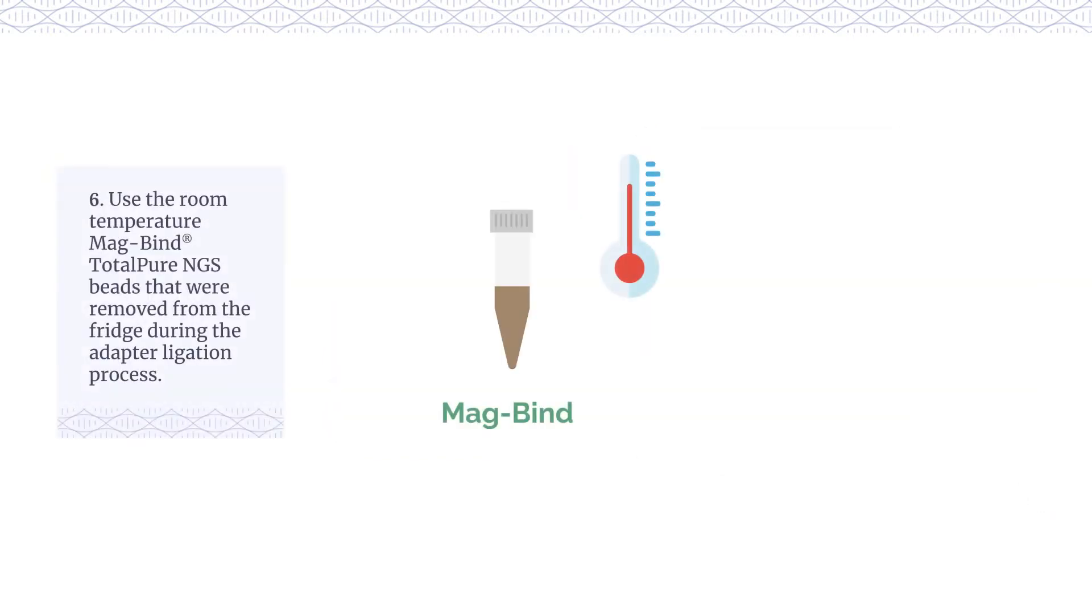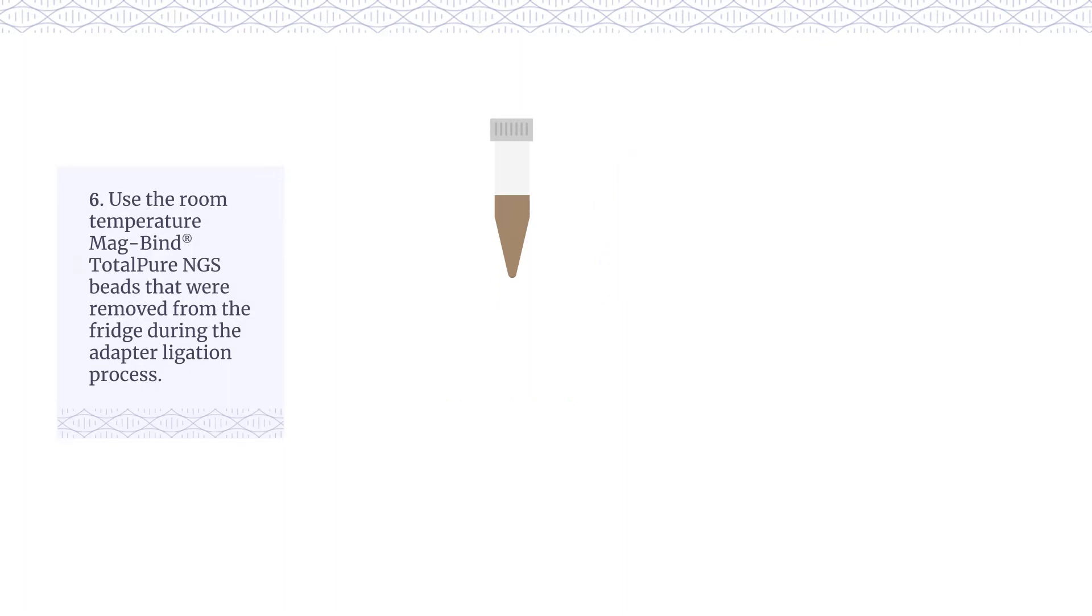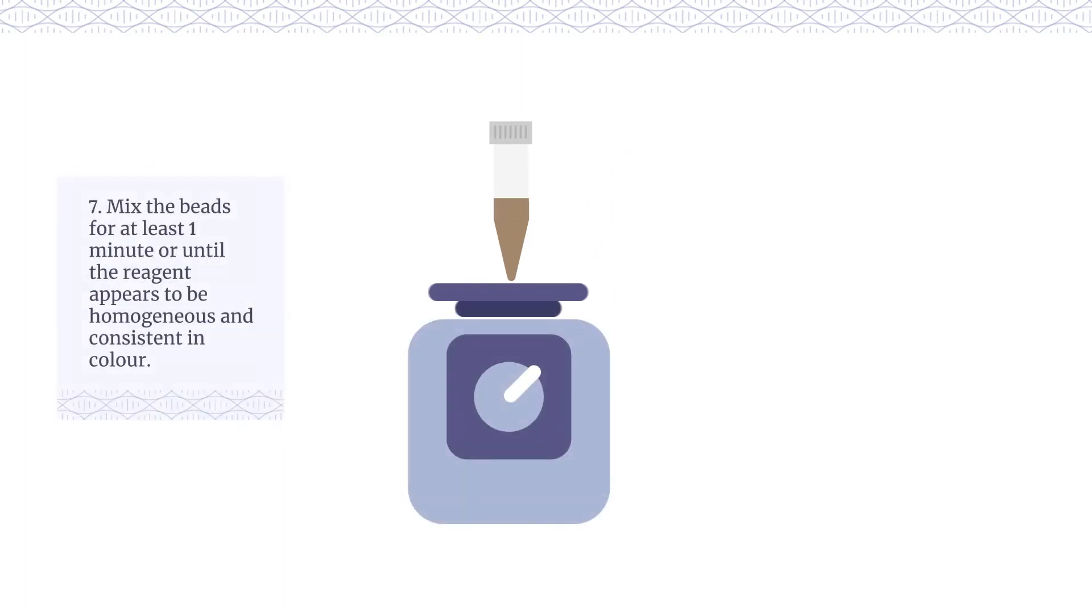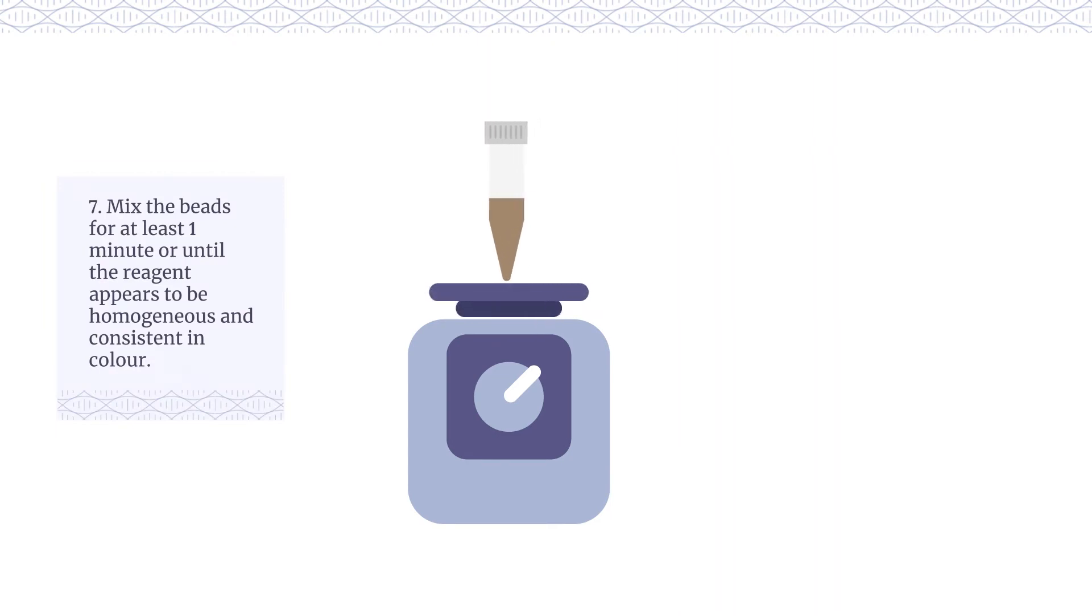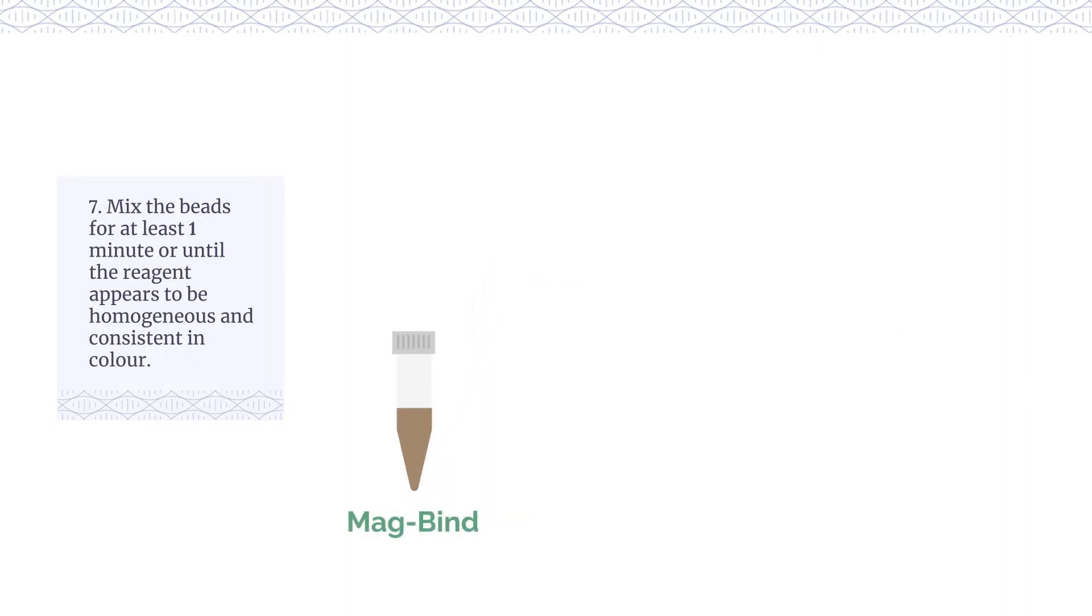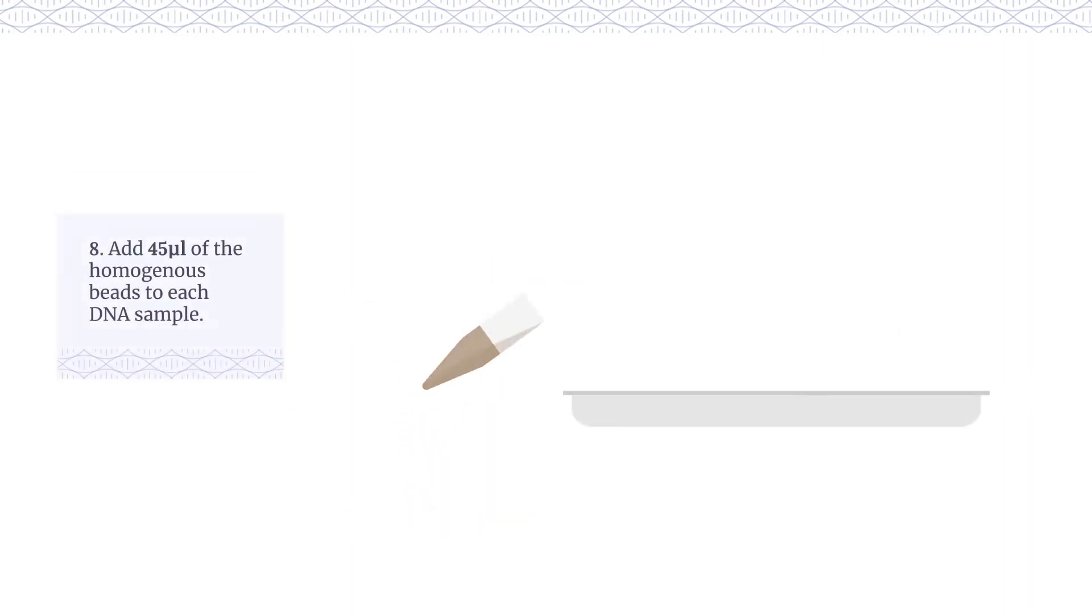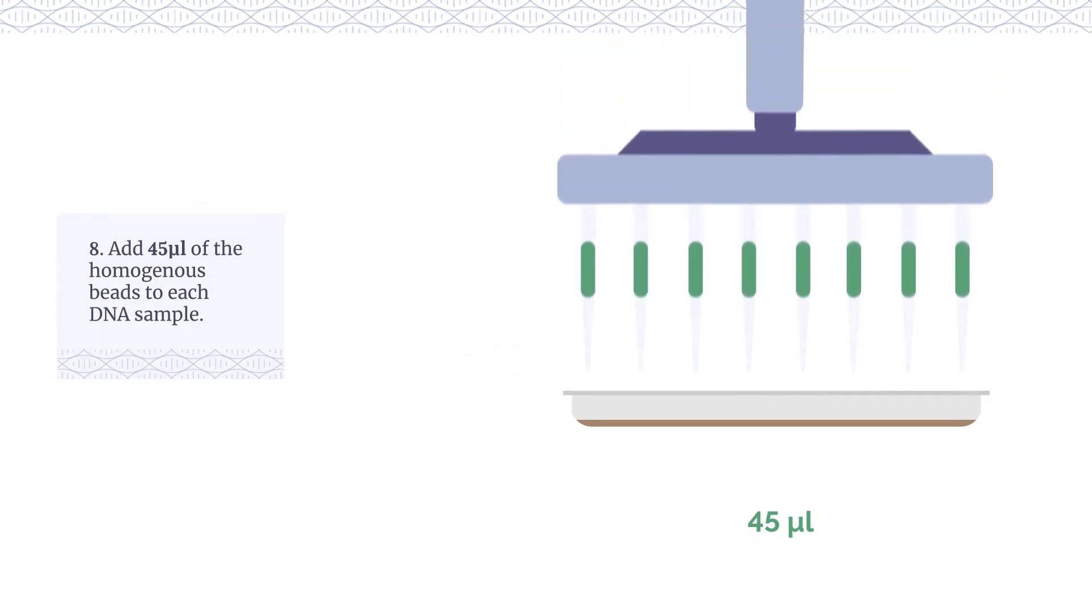Use the room temperature MagBind Total Pure NGS beads that were removed from the fridge during the adaptor ligation process. Mix the beads for at least one minute or until the reagent appears to be homogenous and consistent in colour. Add 45 µL of the homogenous beads to each DNA sample.